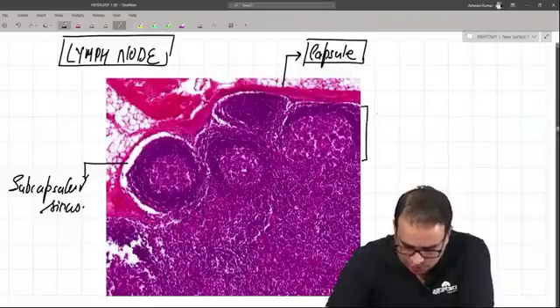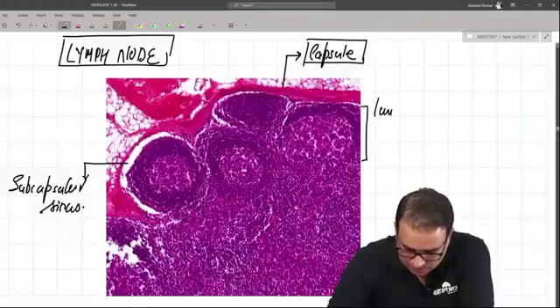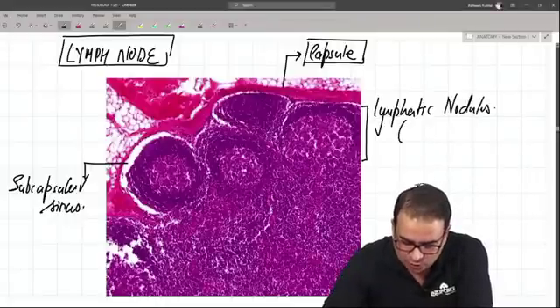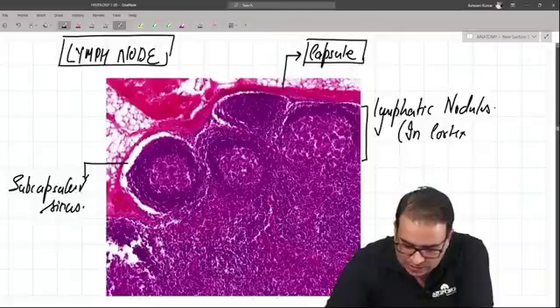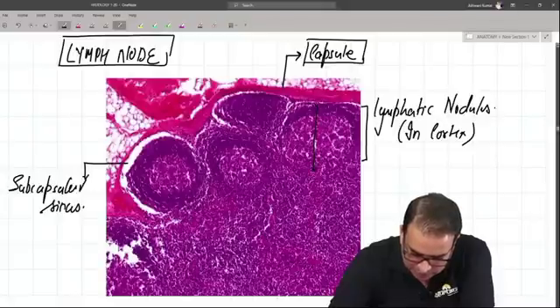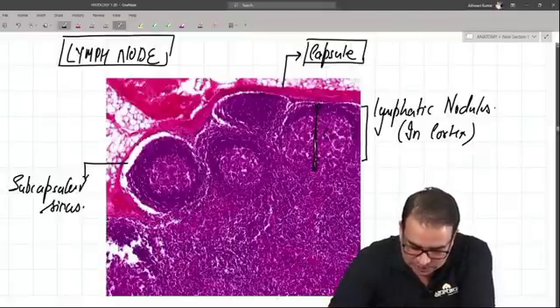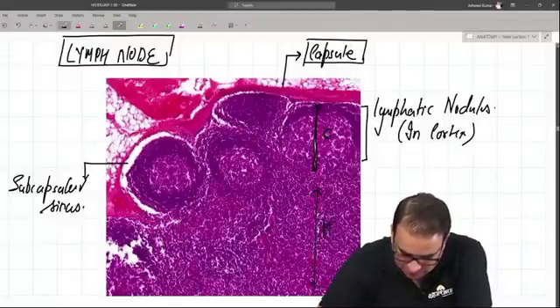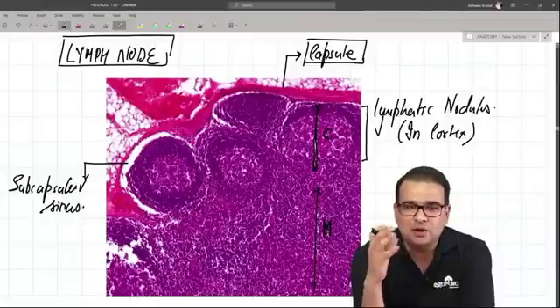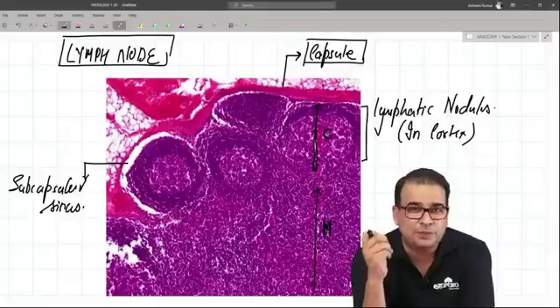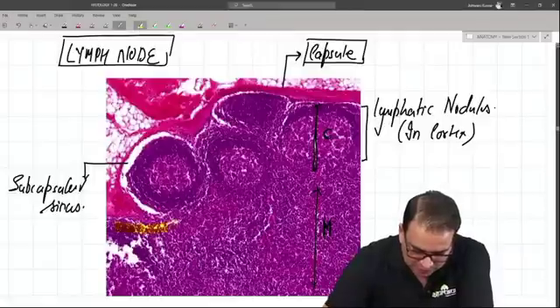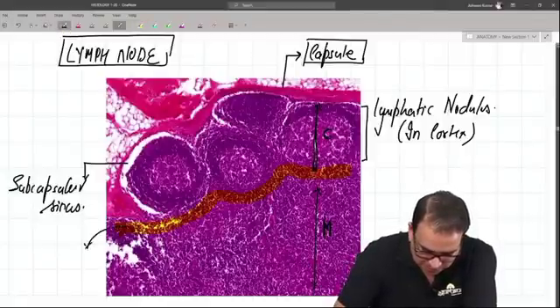These are the lymphatic nodules, predominantly having B cells, and these lymphatic nodules are present only in the cortex. This portion here is the cortex part where the lymphatic nodule is present, and the rest is the medulla. We can clearly divide the lymph node slide into cortex and medulla. In between the cortex and medulla, this zone is called the paracortex.